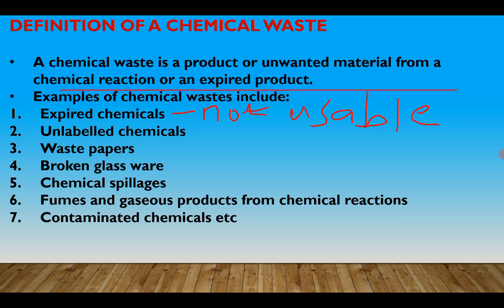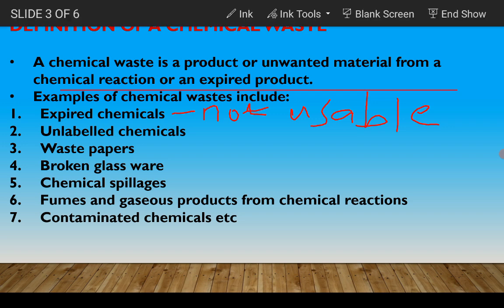Chemicals whose containers are not labeled are not known exactly. We don't know what these are, so they are considered to be wastes. So these are not known. They are unknown chemicals and therefore may not be used.